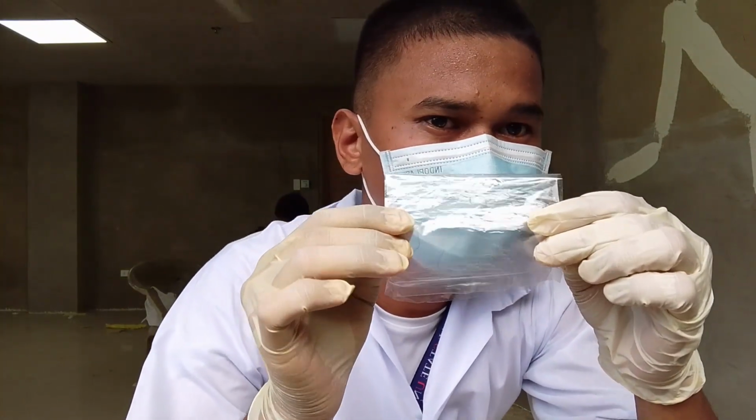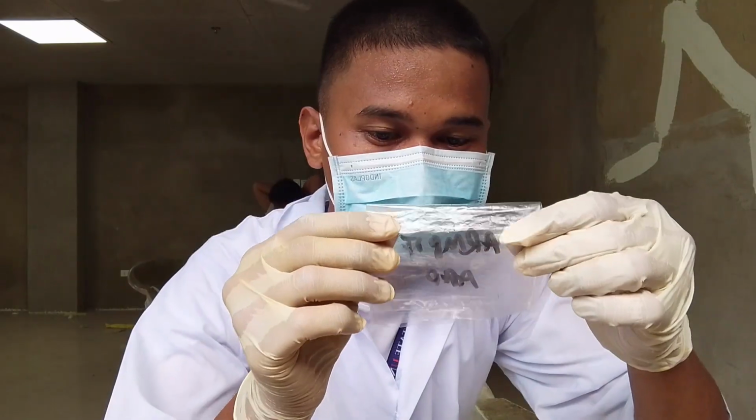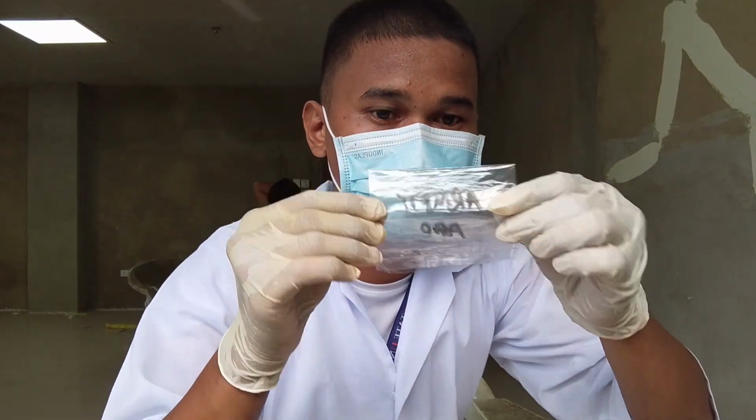I am done collecting the armpit hair, so I will put a label on this. I am done labeling the armpit hair, so I will now proceed to the leg hair.